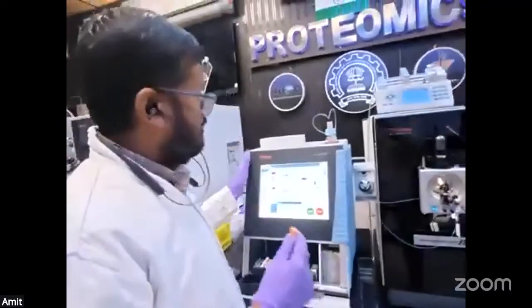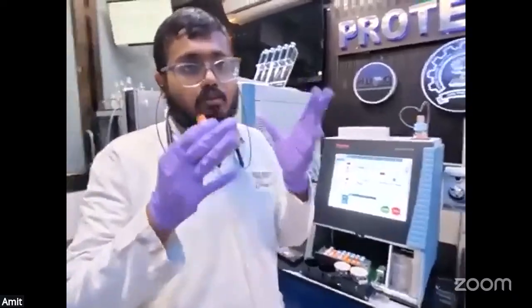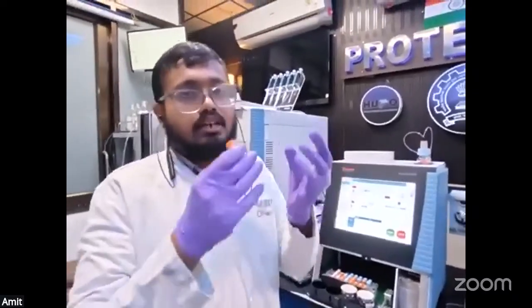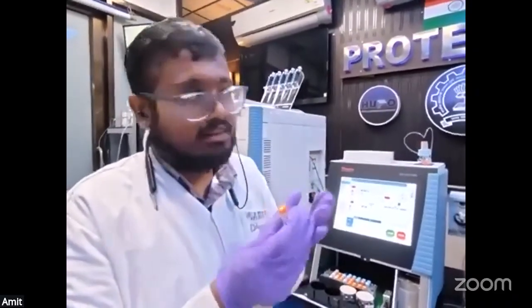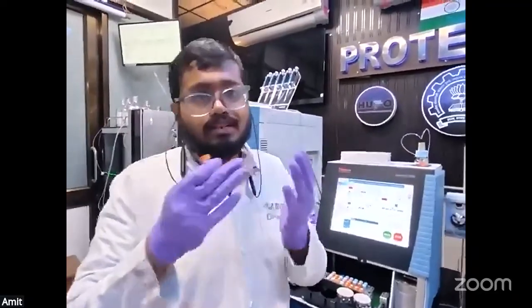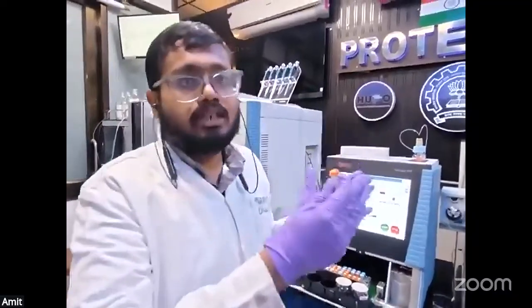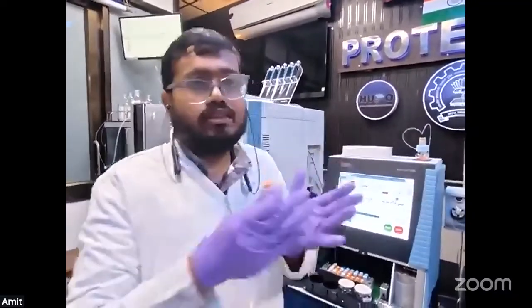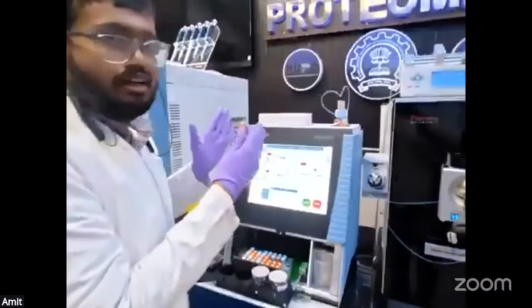So LC here is nano LC, or nano liquid chromatography. You know that the peptides come from complex samples, like from a tissue or cells, which contain a complex mixture of proteins, which we are digesting into peptides. Now we want to see what peptides are present and quantify them, right? So this cannot be achieved if we inject all the peptides in one go, because the detector and the mass spectrometer will get oversaturated, and that's why we need a kind of peptide separation, which we do using reverse phase chromatography. And for this instrument, we use nano LC.